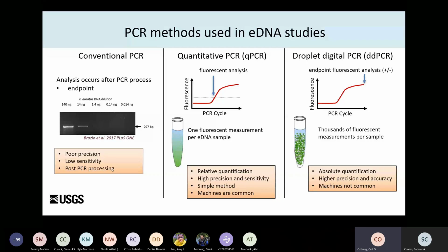In this schematic you can see all these little droplets, and inside each one there's a PCR going on. Each of these oil droplets ideally contains 0, 1, or a few target molecules. The PCR occurs in any of these droplets that contain DNA, and detection occurs at the end point of the PCR, where the fluorescence from each droplet is independently measured.